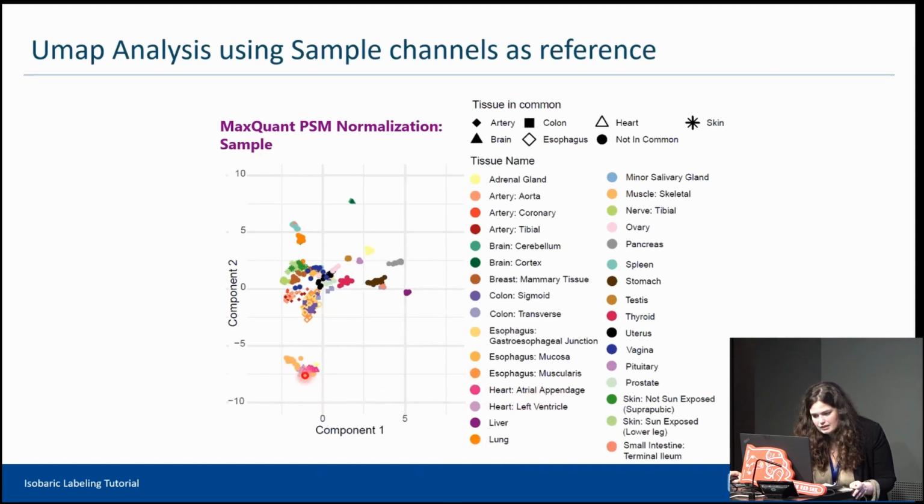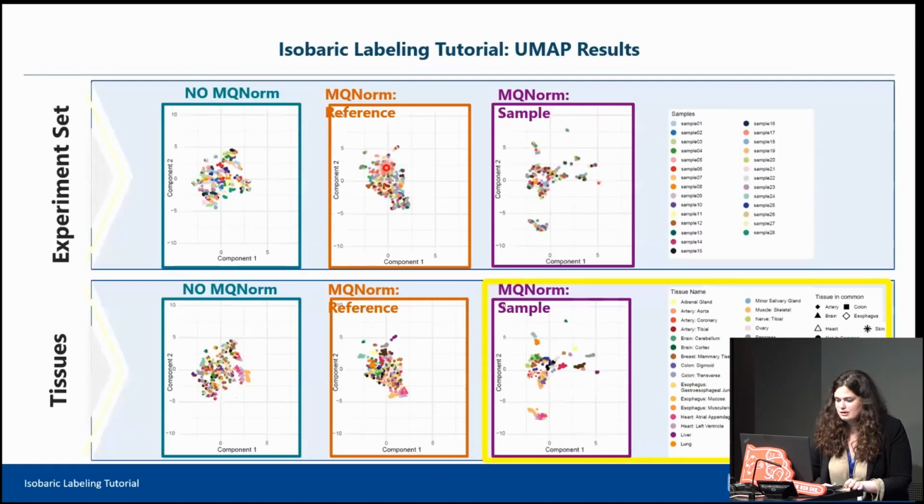All the biological samples are here, and it is also together with the muscle. If you know a little bit of biology, it's very good that they are clustering together. At the same time, you can see this small triangle here, which are the 2 parts of brain. So we can say that this one was the best compared to all the others.